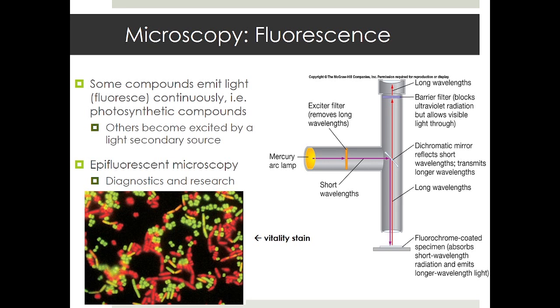That difference in that disease state, we can target and visualize with something like fluorescent microscopy, because you can make a tag that will bind to that structural difference in that protein if it's present. And if those cells have it, they'll bind your tag and they'll glow. So if you're looking for whether or not somebody has a disease, you can plate some cells out of theirs, and then you can add your tags in that will bind specifically to the change that you're looking for. And if they're present, you'll see them. If the person has normal cells that are not diseased, it won't stick and you won't see anything. So that's one of many ways that we use microscopy in diagnostics and also in research as well.